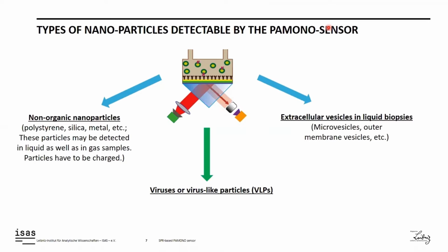On this image, two different regions are visible: the region where signals from 200 nanometer particles are focused, and the region where they are non-focused. Focused regions, in the upper part of the image, are very bright, and unfocused signals contain dark spots in the center of the binding signal.